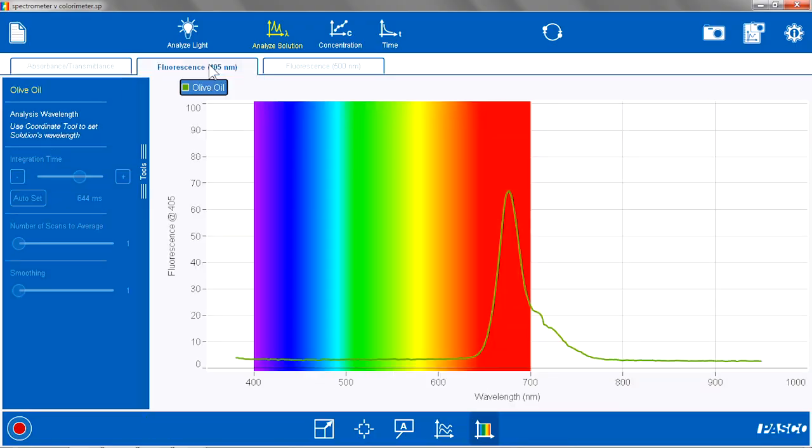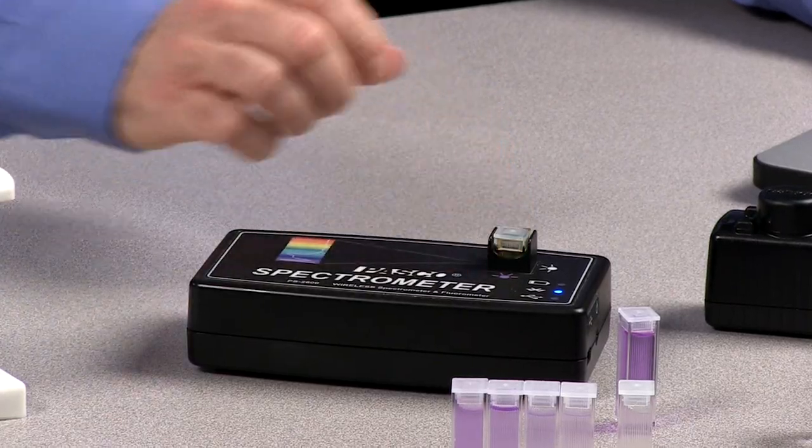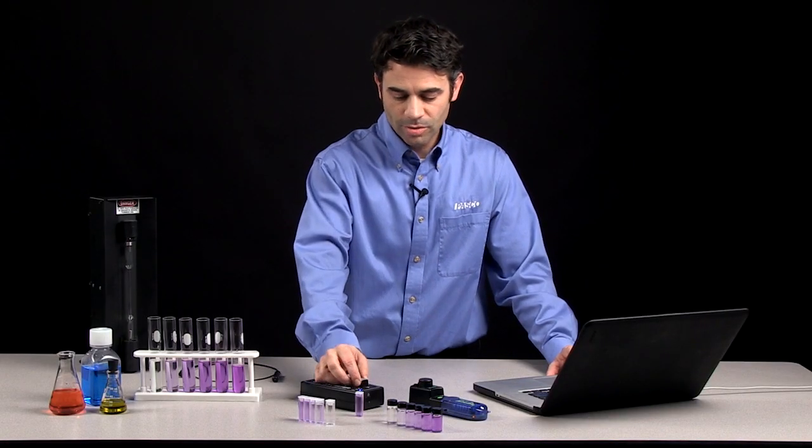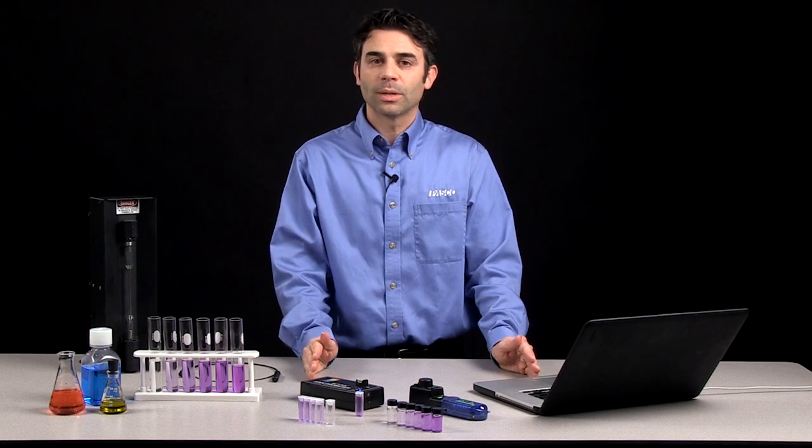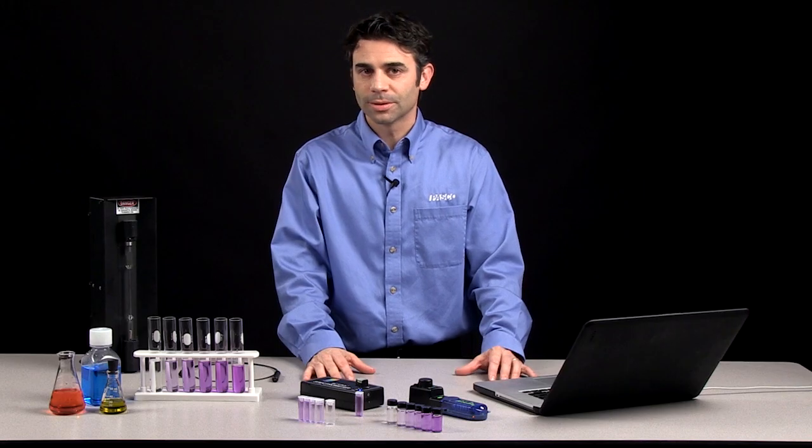And I can go to the fluorescence page in the spectrometry app. And I can see the fluorescence wavelength of that particular sample in the 670 or so range of the spectrum. So a little extra functionality with the spectrometer and the full visible spectrum. But both of these are great tools for initial analysis of colored solutions.